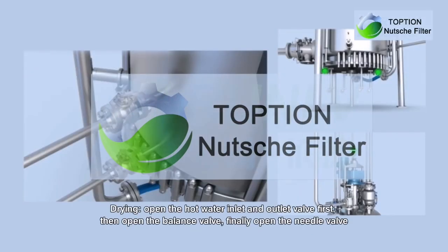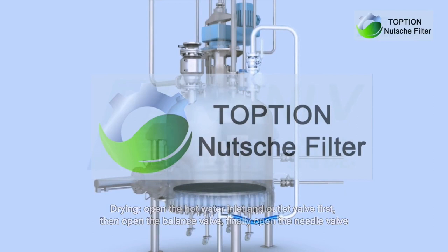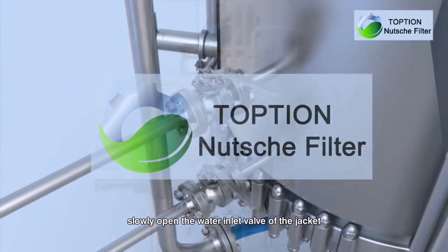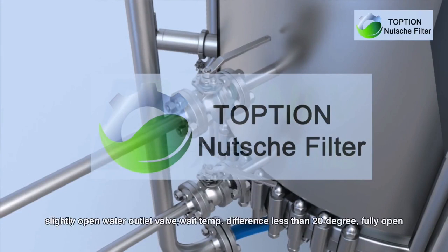Drying: open the hot water inlet and outlet valves first, then open the balance valve. Finally, open the needle valve. When drying under vacuum, the balance valve should be opened in advance. Slowly open the water inlet valve of the jacket, then slightly open the water outlet valve. When the temperature difference is less than 20 degrees, fully open.